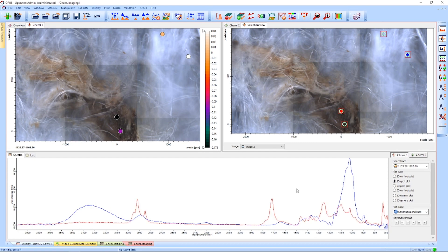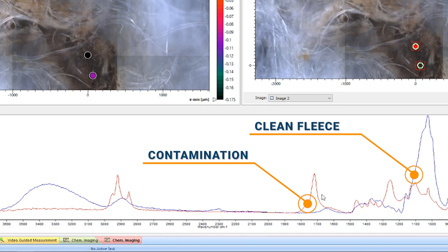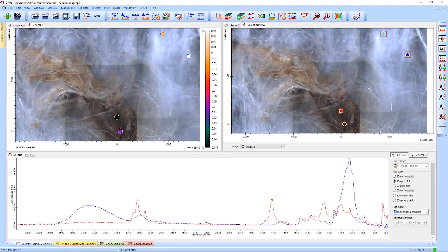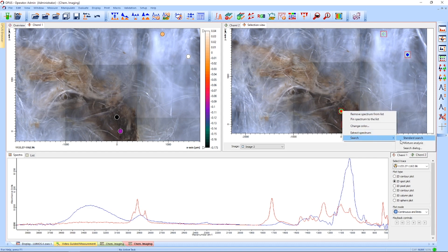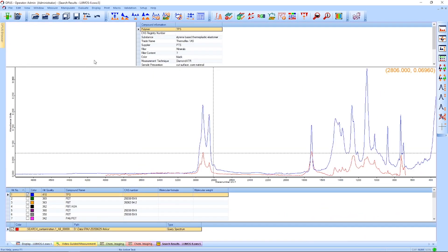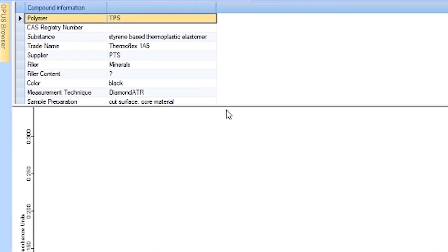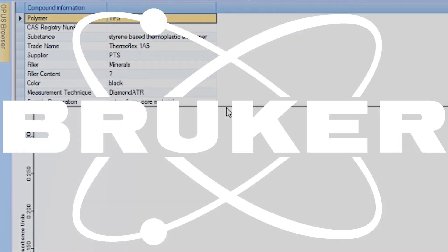Now with the measurement finished, we can see that the clean areas on the fleece have a very different IR spectra from the spots with contamination. To figure out what those stains are, we can compare the spectrum to the reference library. This search shows us that the stain is a typical thermoplastic elastomer. Now we can use this information to determine what caused this contamination in the first place.